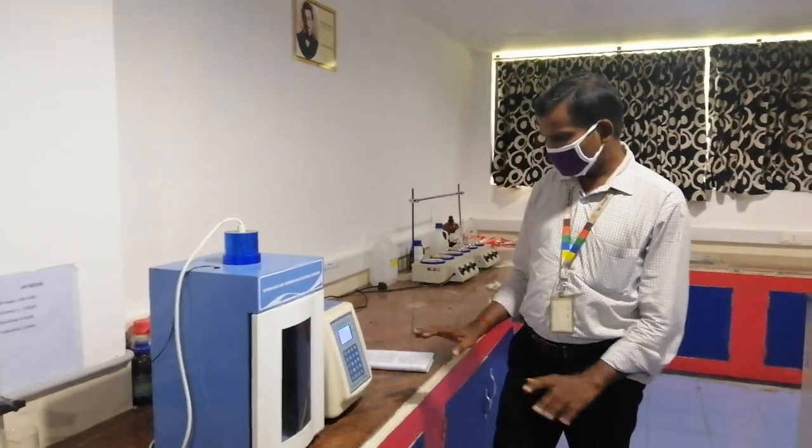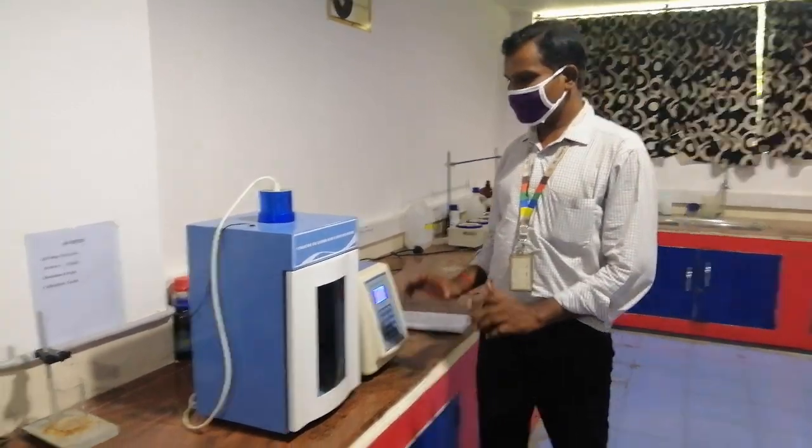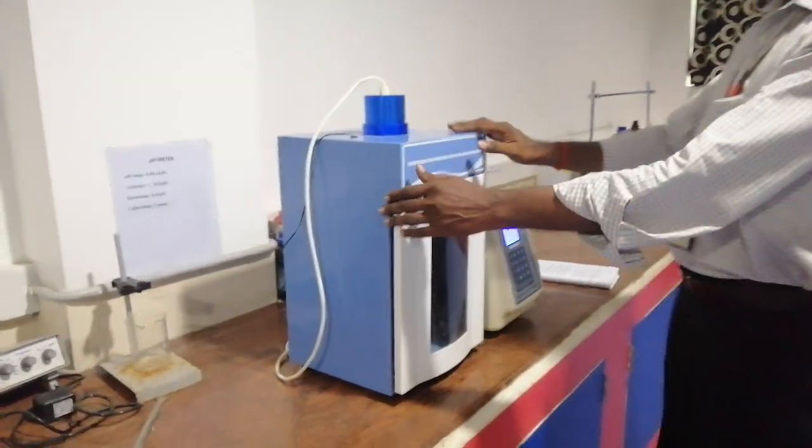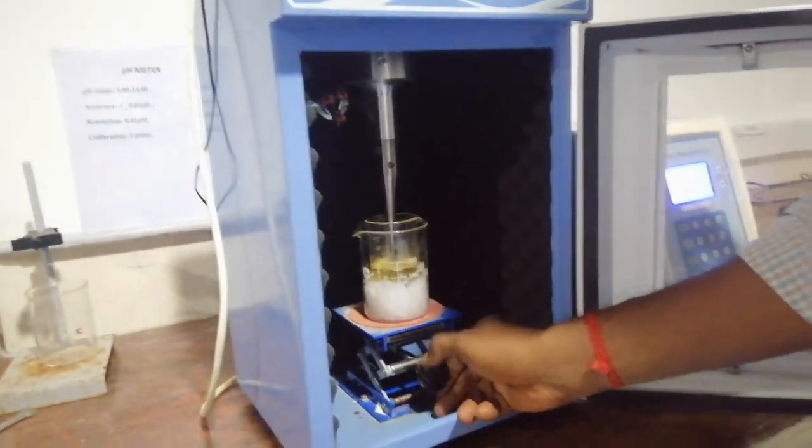Now your 30 seconds of cell disruption is over. Okay, so it is stopped. Your first cycle is over, and then take out your sample. So lower the platform.